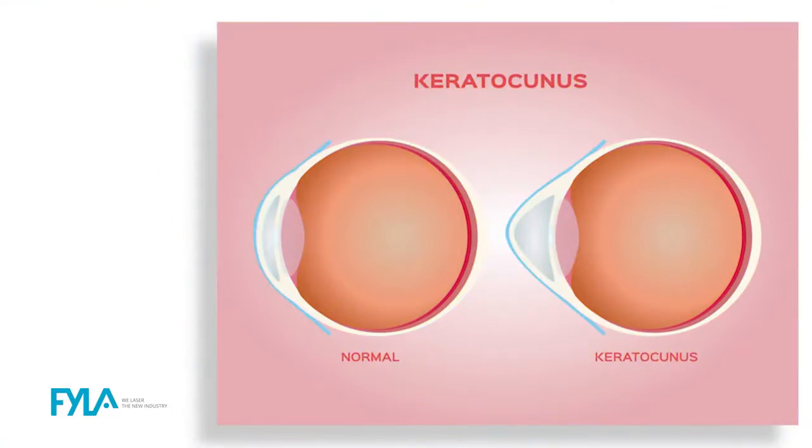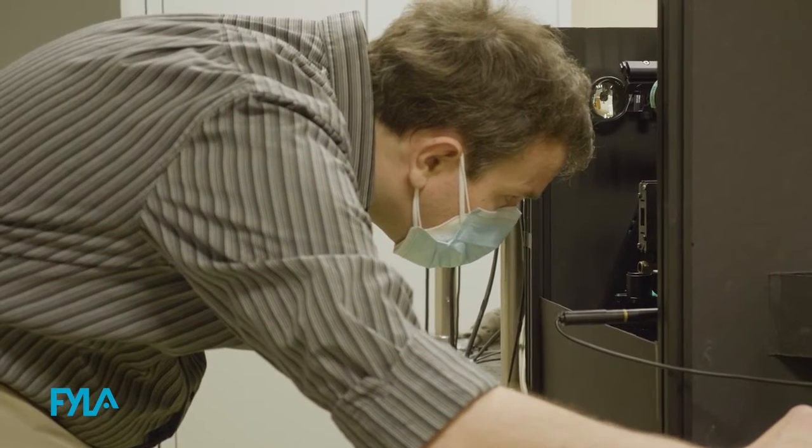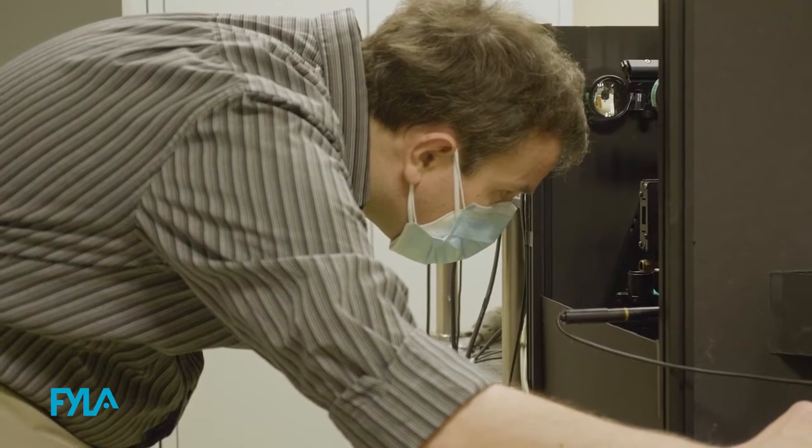One of the things we're always looking at is identifying biomarkers in ocular tissue to let us know if there's a disease which is starting to develop. So one of the diseases, keratoconus, you can start to see that the interweaving of the anterior of the cornea decreases. So the amount of depth of interweaved tissue actually goes down. So it's one of the potential warning signs that you could use. And you can see where the collagen interweaving decreases using second harmonic generation.